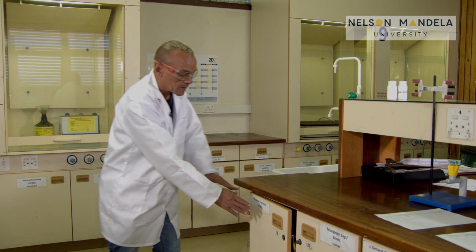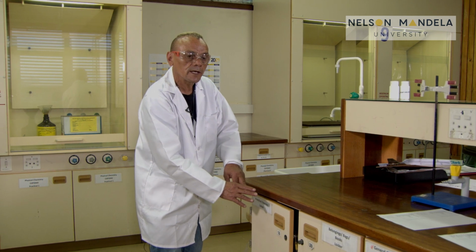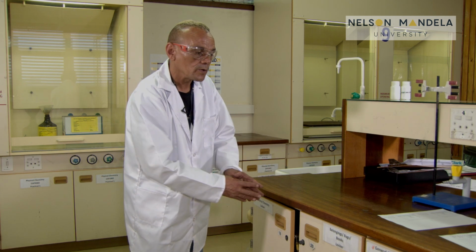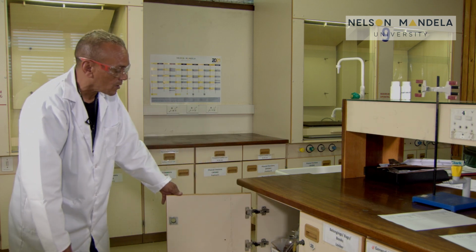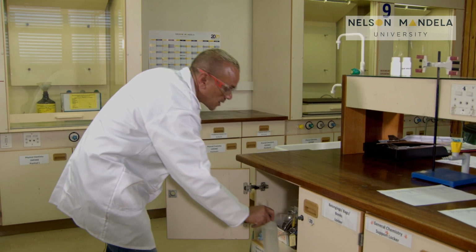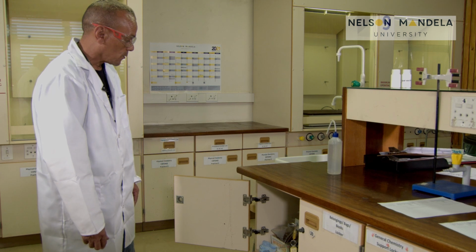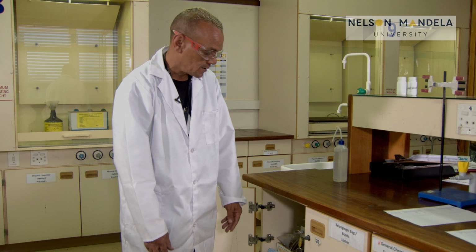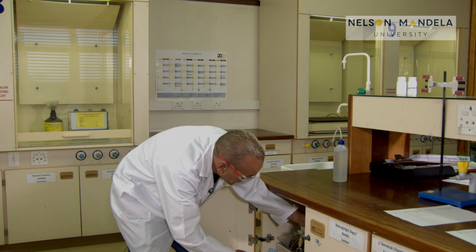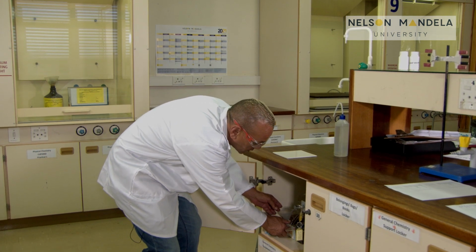Important, your analytical chemistry locker is called the analytical chemistry locker because it contains a mixture of analytical and general chemistry glassware, and we are going to identify them as we go along. Inside that specific locker, you will find a variety of glassware. You need to be very careful. They are all glassware manufactured under specific conditions, and they are extremely expensive. So please, it needs to be handled with care. Whenever you unpack it, you need to do it very, very carefully.